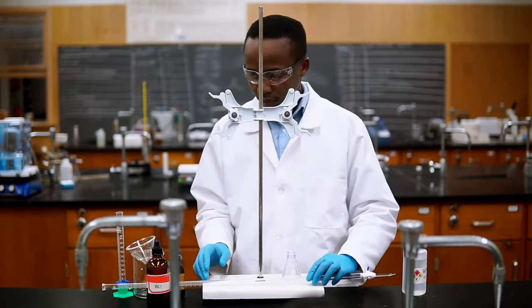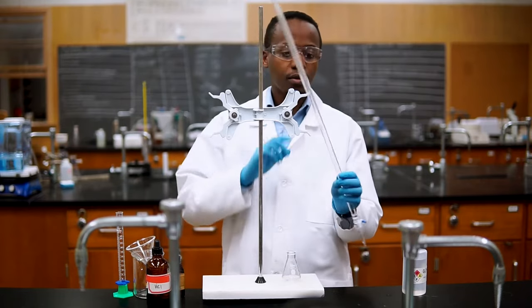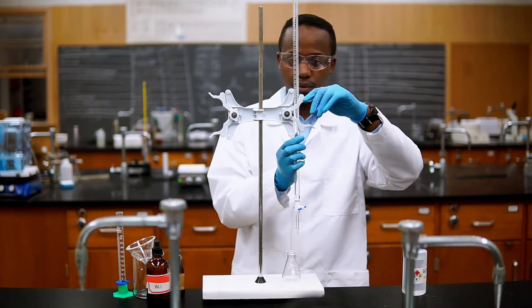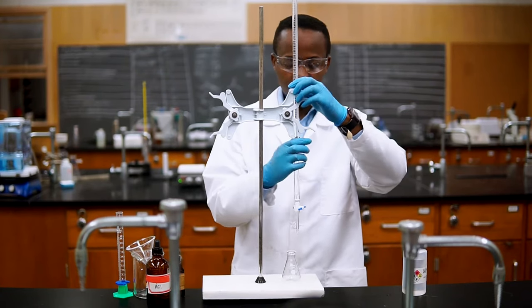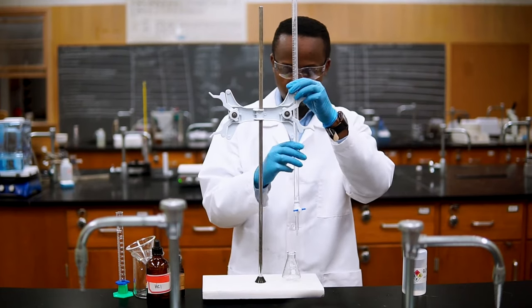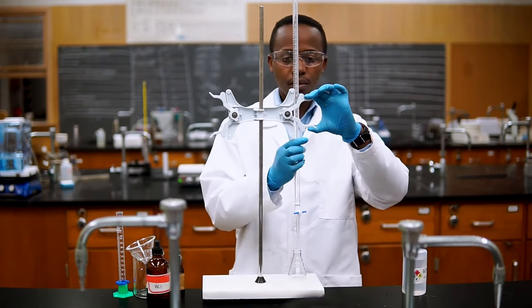First let's assemble our titration setup. We'll add our clean burette to the ringstand and clamp. This is where we'll add our base, which again is referred to as the titrant in this case. Our acid will go in an Erlenmeyer flask below the burette. This is our analyte.